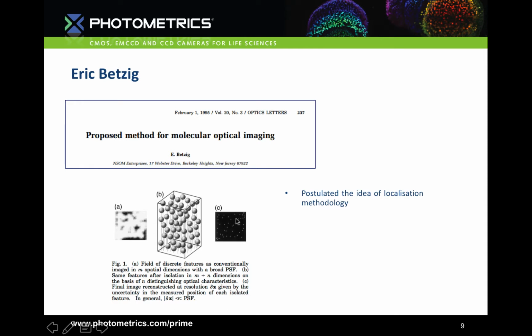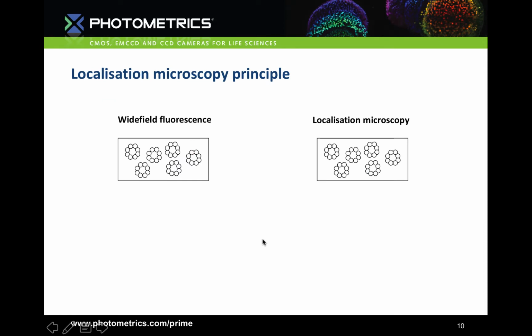The trouble is you would need to have probes that you can turn on and off, and at the time he published this paper, there were no such discovered probes. The principle of his idea was strong, though.